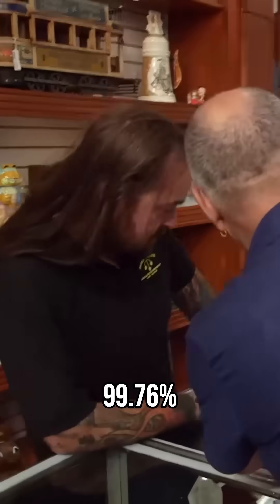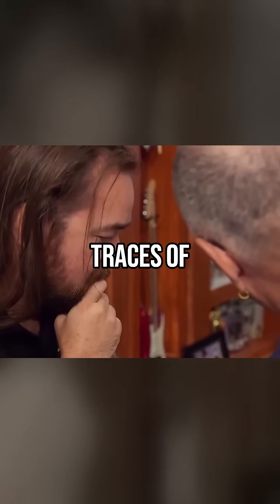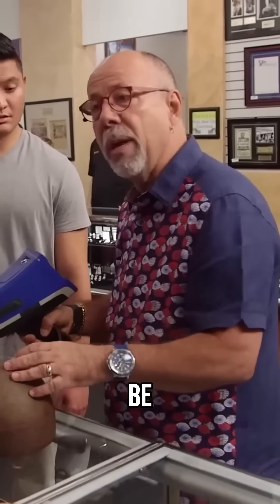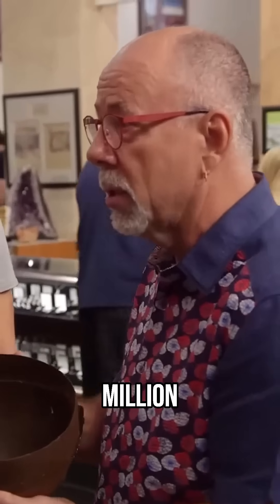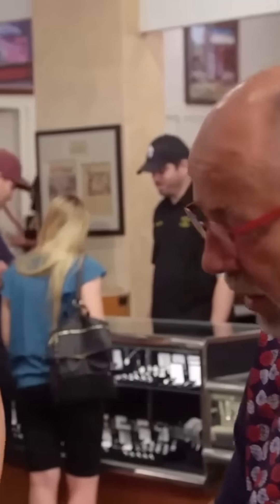So it's made 99.76% iron, and then traces of copper, zinc, chromium. This is carbon steel — so this is what it should be made out of. It's official. It's a one in a million. I mean, it's that rare. I've got goosebumps. I just don't see these things.